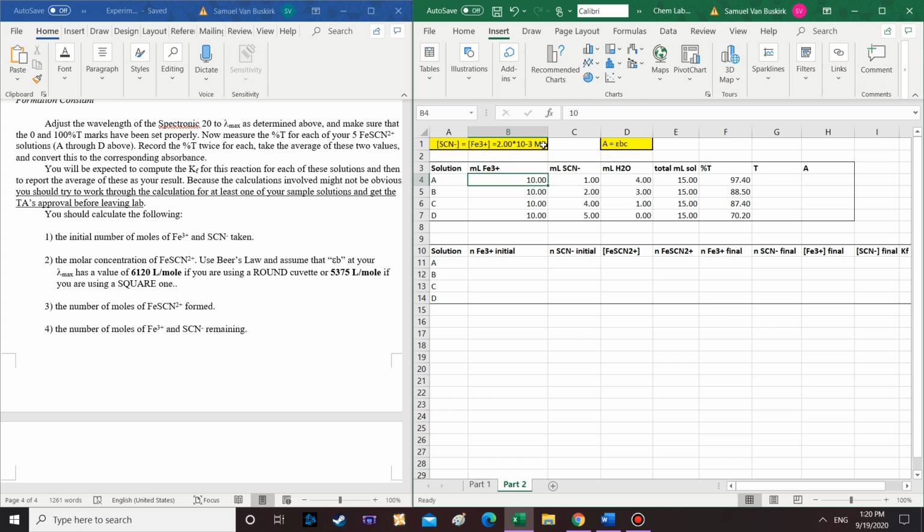In order to calculate initial moles that you added of a solution, you'd need concentration and volume, right? Well, we have both of those. We have the initial concentration of both of those solutions, and the volumes. So molarity, the concentration up here, is moles per liter, moles divided by liters. So if we multiply by the volume that we added in liters, we're left with moles that we added in that aliquot of solution. So I made this chart down here, which is just detailing all of these calculations that we're going to work through.